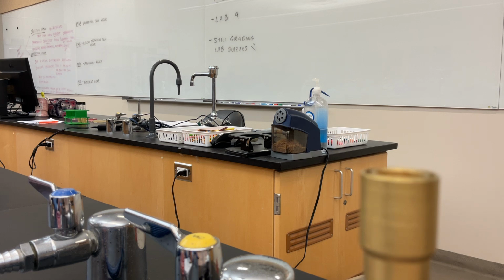Now, today we're going to be setting up mannitol salt agar, EMB, MacConkey, and nutrient agar. We've worked with nutrient agar before in Lab 8. Was nutrient agar selective or differential in any way, or was it just a general growth media? General. Good. So this is our general growth media. Why do you think I want to set up a general growth media when I'm setting up these other ones? What would be the purpose? You got it. It's going to serve as my control.